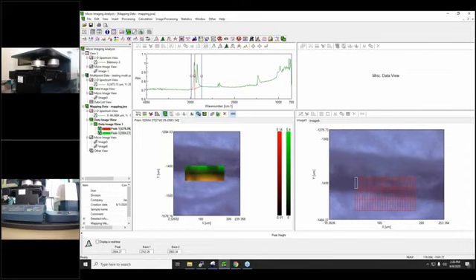So this is what I was planning to present in the IRT 5200. Now I'm going to move to the IRT 7200. Please bear with me 30 seconds.